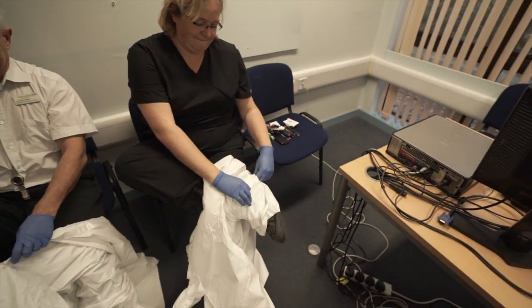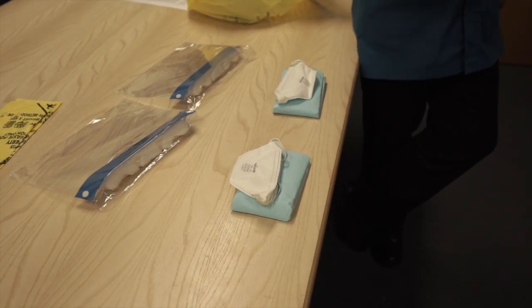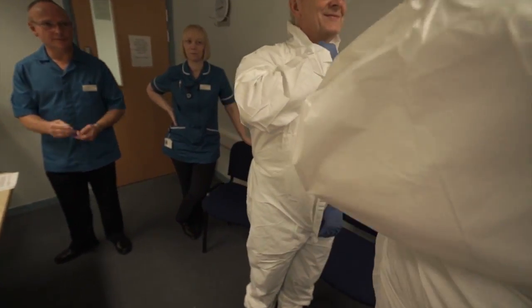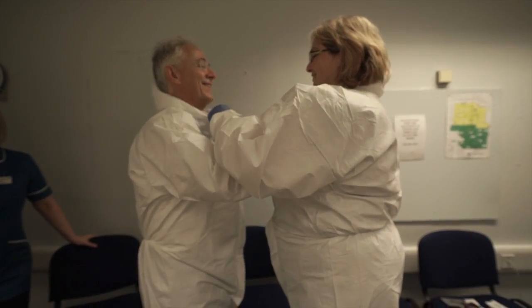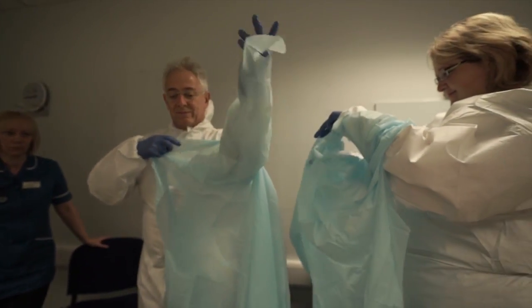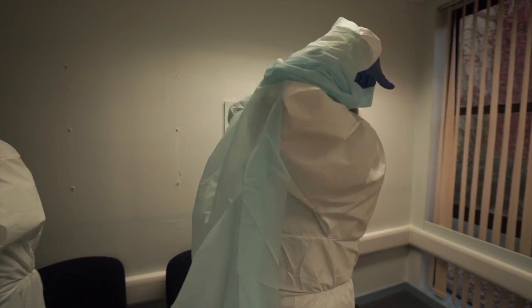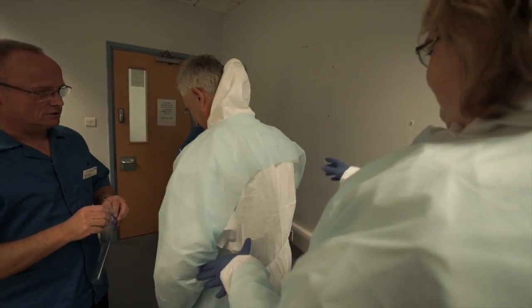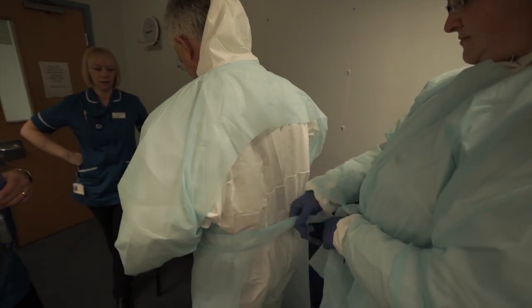I hope they come up with a vaccine soon. So do I. Nice handler. Thank you. And then you can either do it up for them or you can do it up yourself at the back.